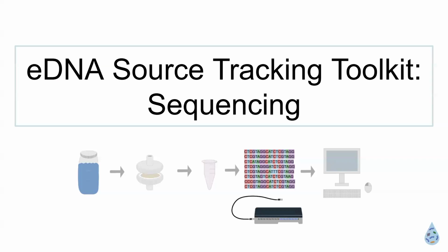You spoke on the replication. Oh, yes, so you want to collect biological replicates as well as do some extraction replicates to make sure that what you're collecting is consistent and can be replicated and wasn't just human error or something that you were doing. So you can either collect multiple different containers of water at each site, or if you have one of the larger containers, that can serve as your biological replicate and you just do multiple filters from that.